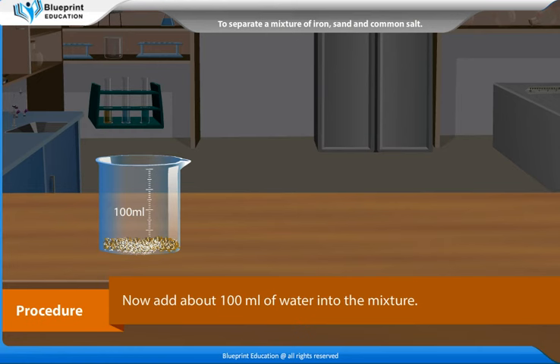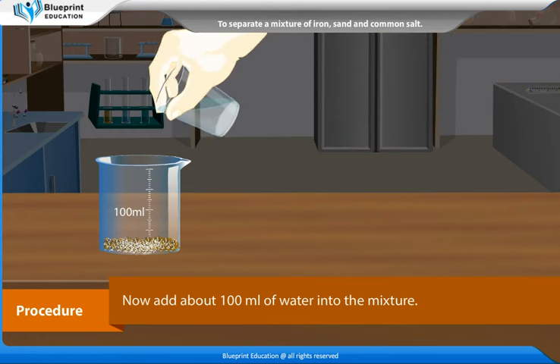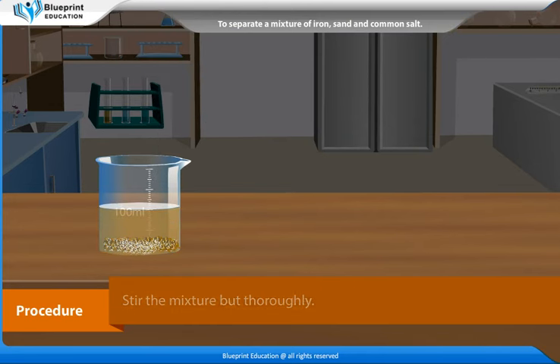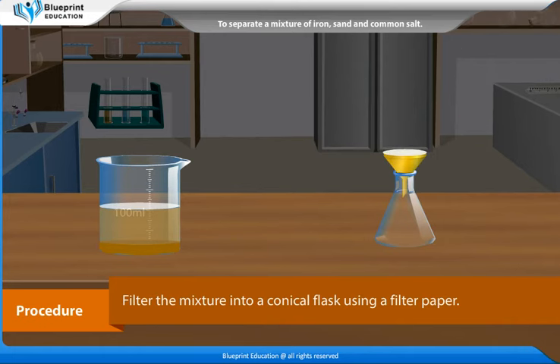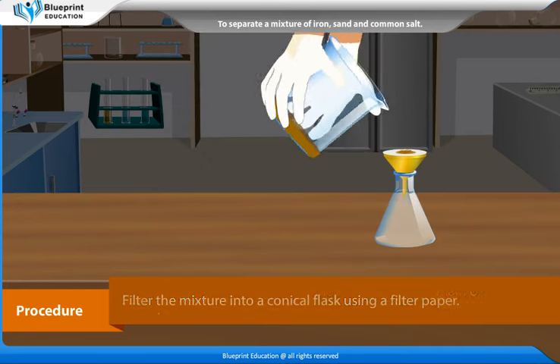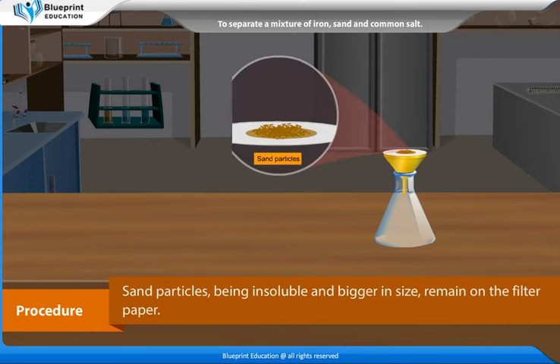Now add about 100 ml of water into the mixture. Stir the mixture thoroughly. Filter the mixture into a conical flask using a filter paper. Sand particles, being insoluble and bigger in size, remain on the filter paper.